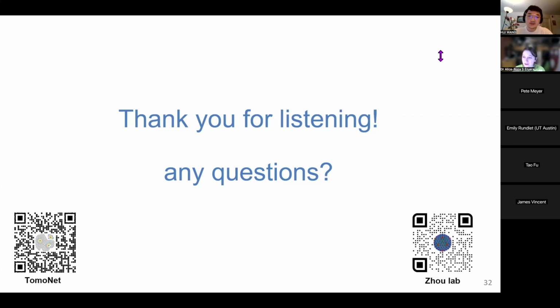Bouncing off of that, does missing wedge correction in IsoNet not fully recover that distortion that you get along the Z height? Yeah, it would help. It would help a little bit if you use the IsoNet corrected tomograms for the picking. Okay. And then our next question is from Miranda Lynch.